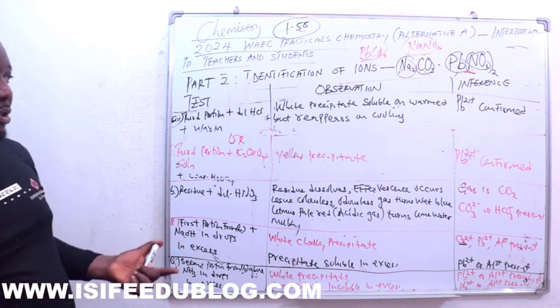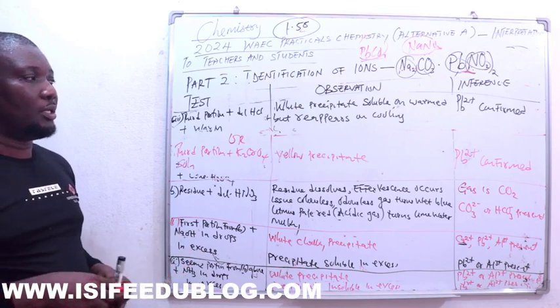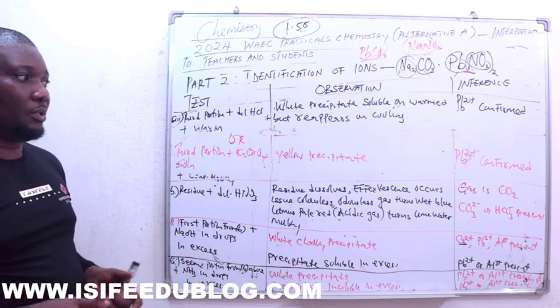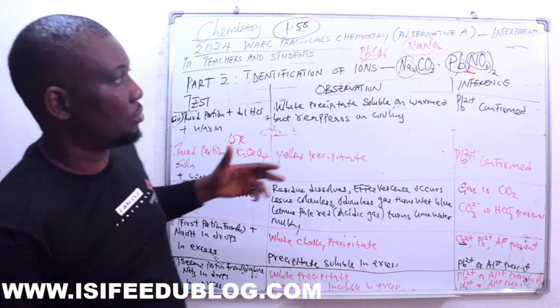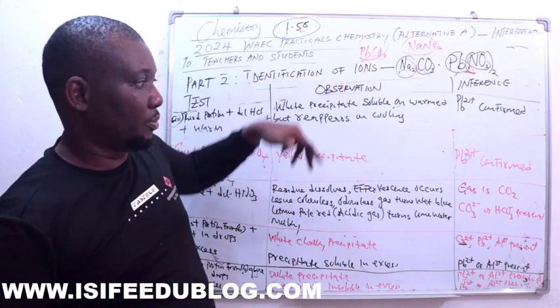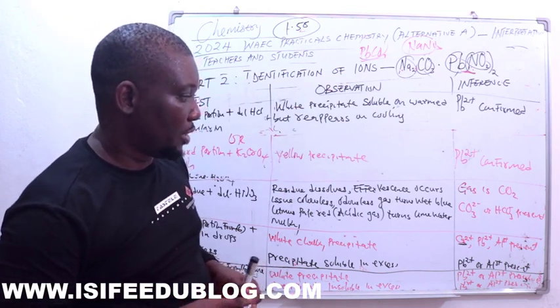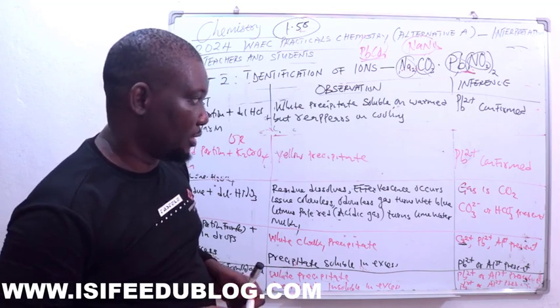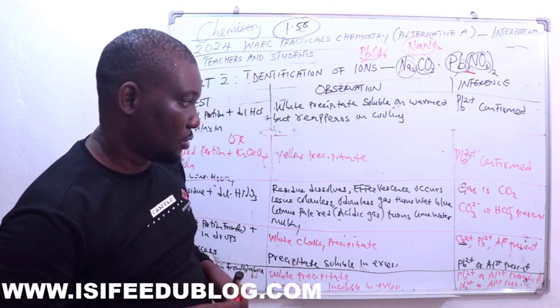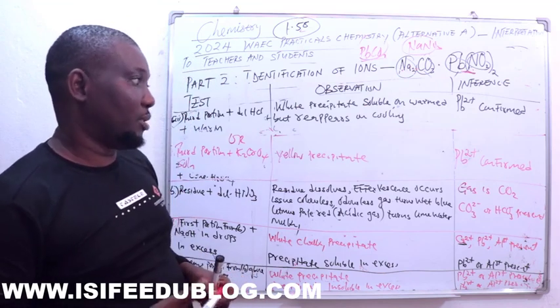Like I said, at this juncture you cannot summarize what you do not know happened. But since you confirmed lead, you confirmed carbonate salt, you confirmed a nitrate salt.